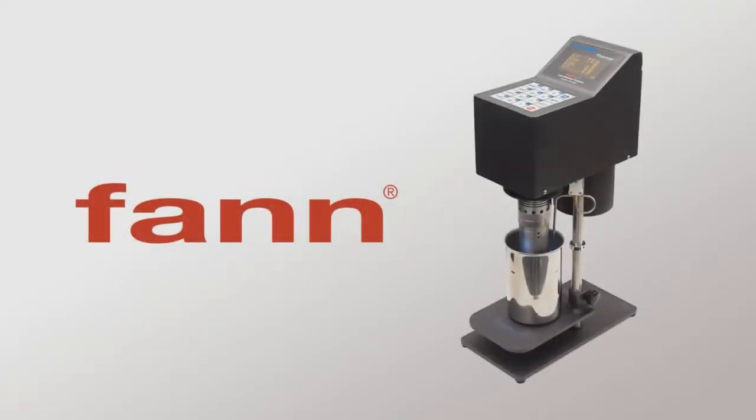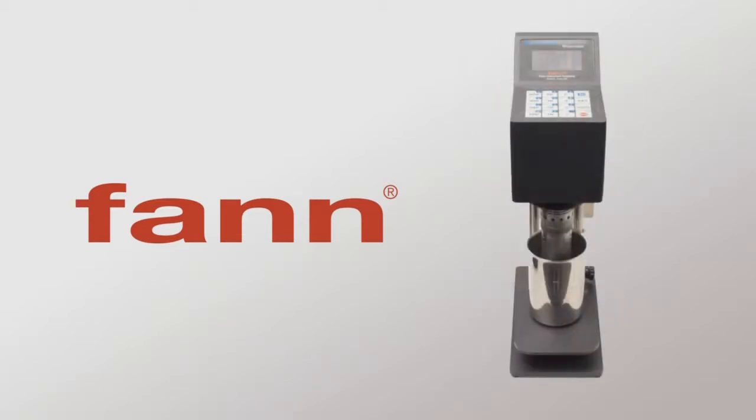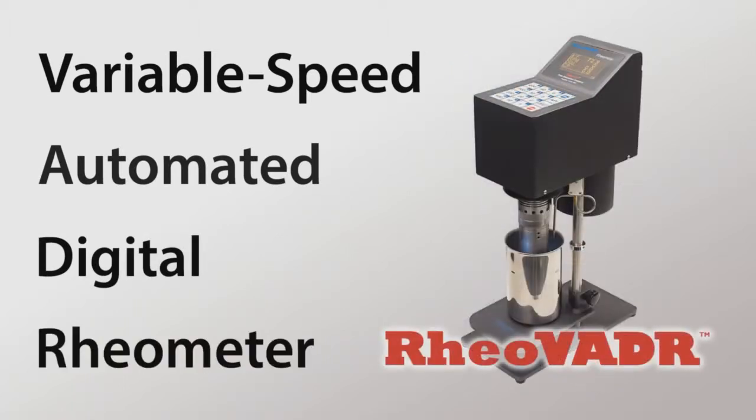It's time to change the way you think about the Standalone Digital Rheometer. Fann Instrument Company's RheoVADR Variable Speed Automated Digital Rheometer redefines the Standalone Rheometer. Hello, I'm Alan Cauley with Fann Instrument Company. I'd like to introduce you to the Fann RheoVADR Rheometer.